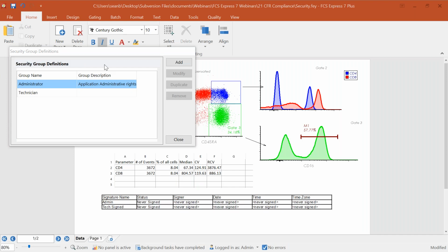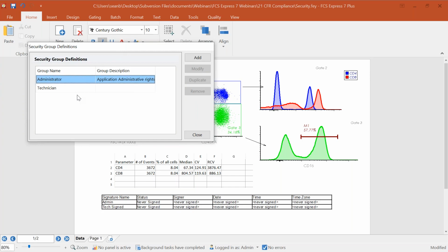And now these are the groups that were available to the two users that we put in the user list, right? So I've seen labs sometimes have 2 levels, they have 3, sometimes they have 4 or 5. It really depends on what type of work you're going to be doing in your environment, what types of limitations and access checks you actually need.